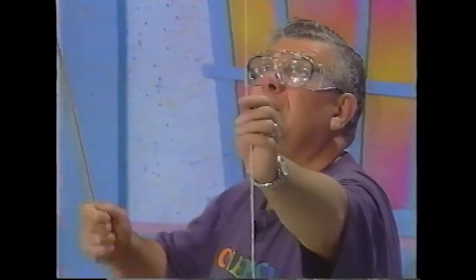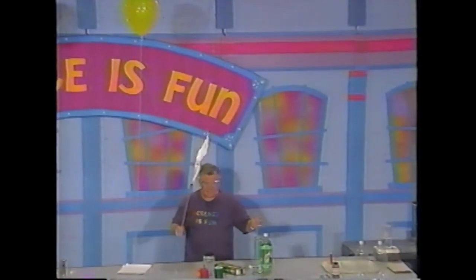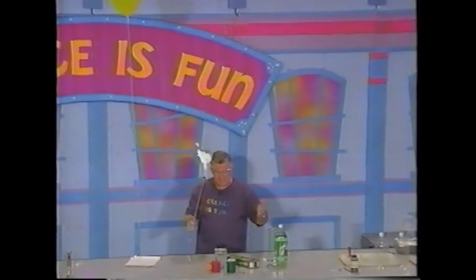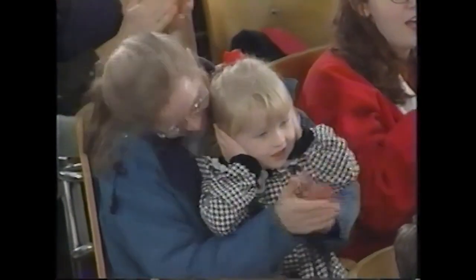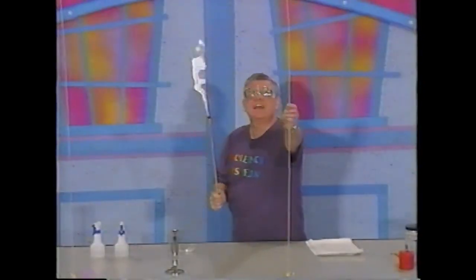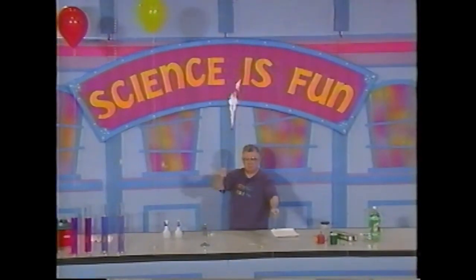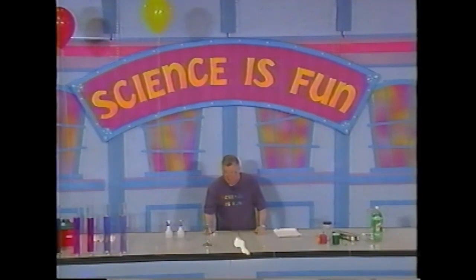As we always do in science, I am now going to repeat the experiment. So I'm going to reach for this other balloon, and did the same thing happen? Yes, and that's what we try to be on the lookout for. All right, so we'll move on to the next balloon, and we'll bring the flame to it, and did that balloon have helium in it?